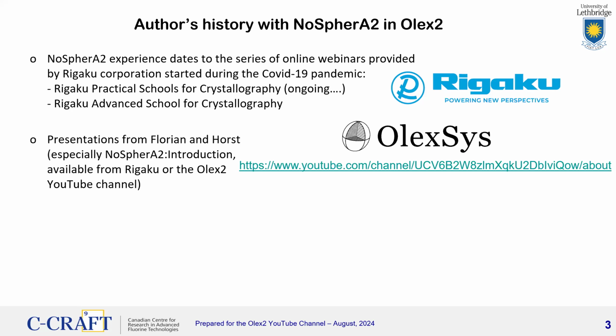And in those presentations, both Florian and Horst from OlexSys gave some presentations that mentioned the development of this NoSpherA2 software. And the presentation by Florian is still available at this YouTube link in the YouTube channel that belongs to OLEX. And I encourage you to watch that video, which has much more details than I can give you on the theory and the methodology.